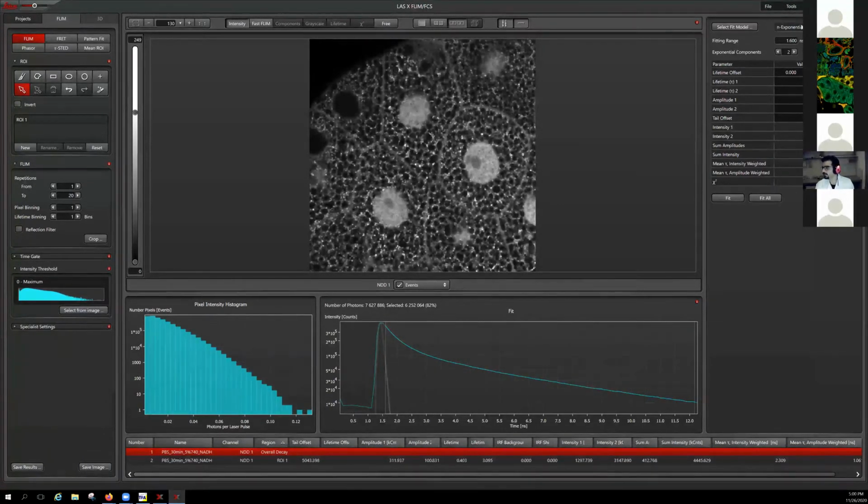So what else do we have here? We can also choose how many components our fitting should have, and that depends, as already discussed several times, on the decay curve and also on the components and the fluorophores that we are studying. There are some values that I would like to talk about. So I just go to 2 components. And first of all are the lifetimes. So the lifetimes we know.